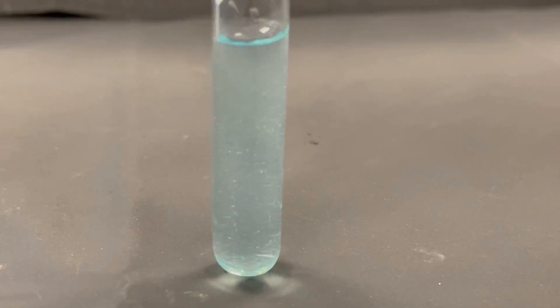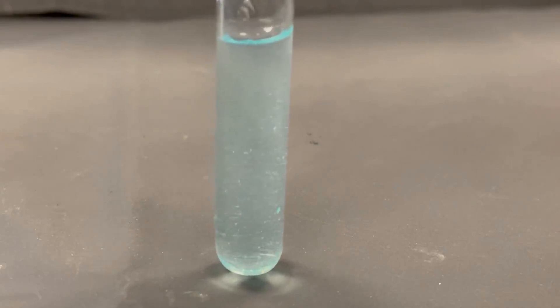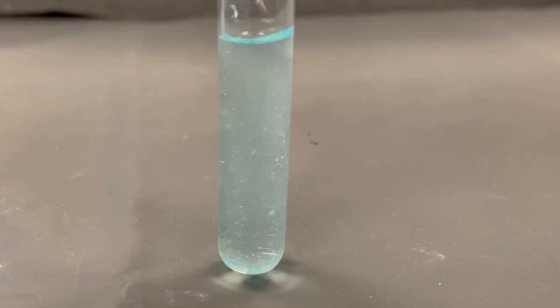After allowing the test tube to rest for some time, I still see no evidence of any solid or gaseous precipitates forming.